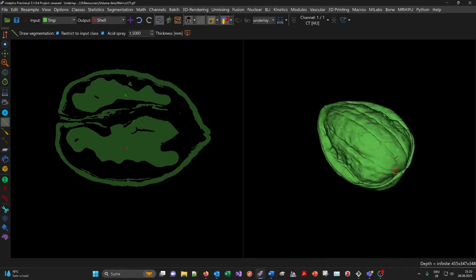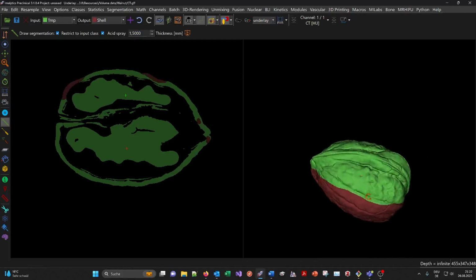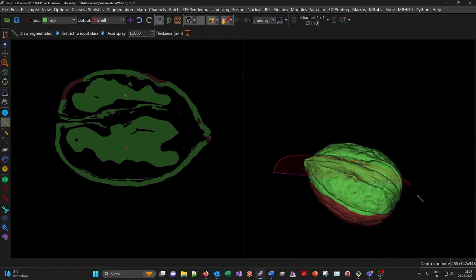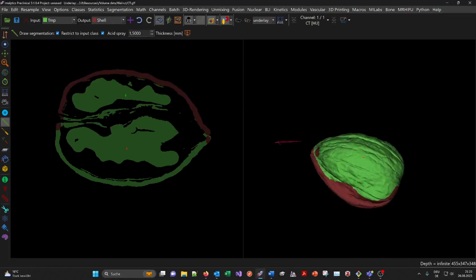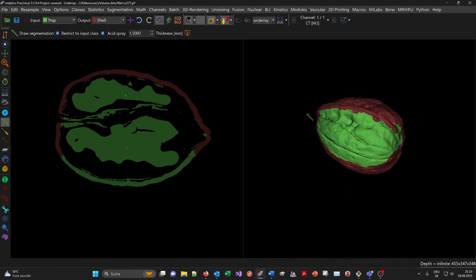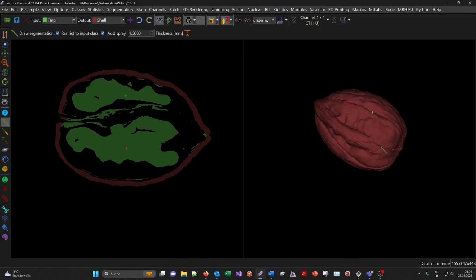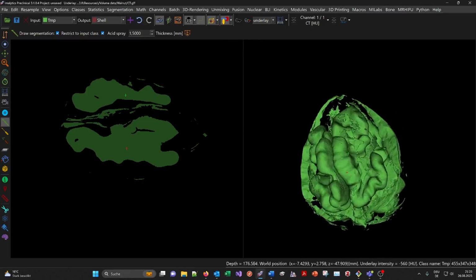And so let's grab it here. So this now goes like acid, and it removes the shell basically. So we can do it a few times, rotate around it, and now let's hide the shell class here. Now we can see what's left inside.